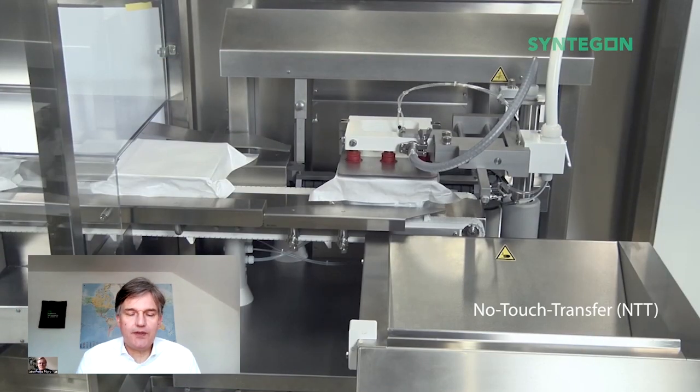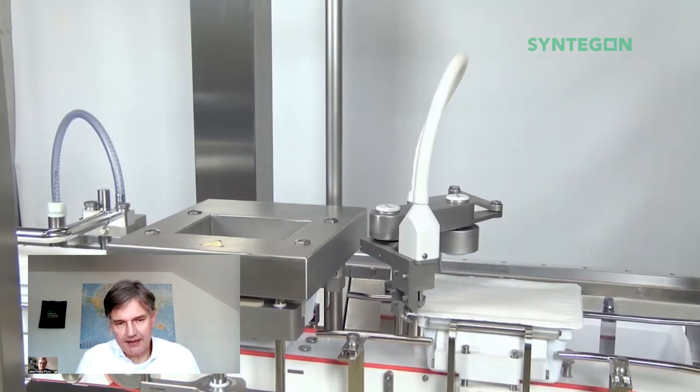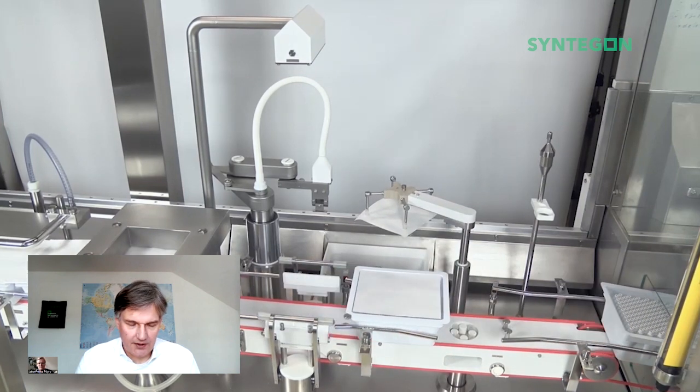What we see here is our tap opening machine. The bag is removed now and we have the tap there still closed with the Tyvek. It's going to the tap opening itself — we have two stations mainly: the preheating and the opening station with our Pharma Handling Unit, a Syntagon Pharma robot. We are preheating the rim for facilitating the opening process and we cut a corner for better gripping. We call it the coffee cream concept.